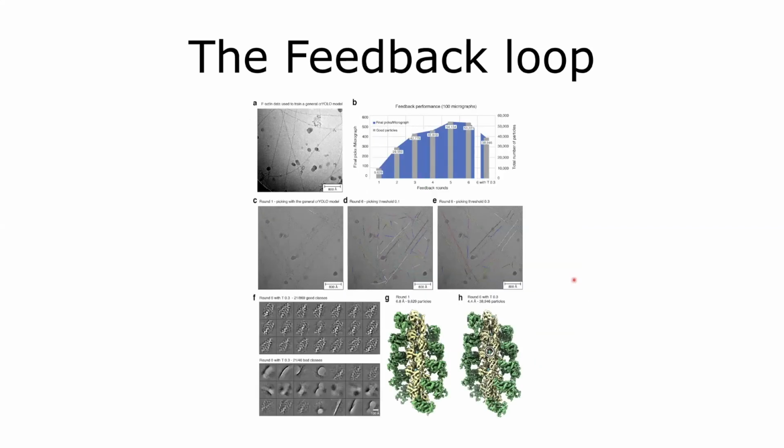And my final example is we also used it for helical specimens. So what we did is we trained a model on F-actin, which is basically straight lines, as you can see here in the upper left image. And it does not have too much in common with an actin-myosin sample, where you not only have the straight line, but it looks more like this Christmas tree shape, so these little arrows.